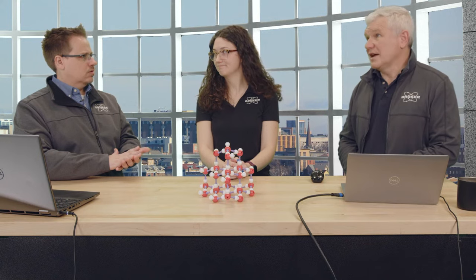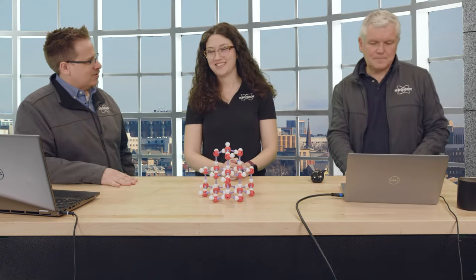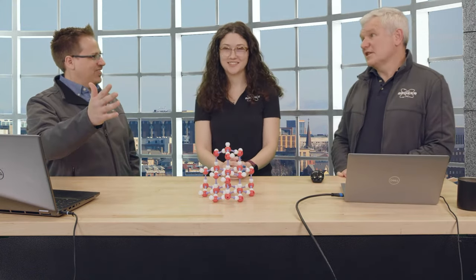That's my experience. I'm not sure whether it's always the case, it depends on the material itself. So maybe even collect at both temperatures. Yes, that's typically what you do.